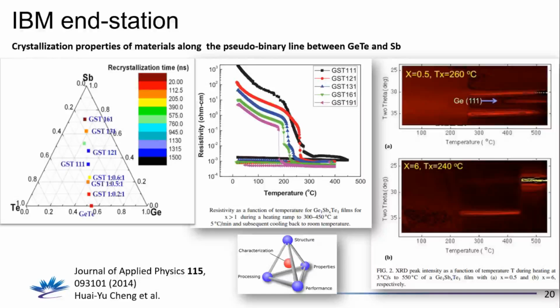And that's how you distinguish the two states in a phase memory chip. And this is reversible, and it can be read with a small voltage that is not going to change the amorphous to crystalline or back. And with these experiments, they are finding different factors.